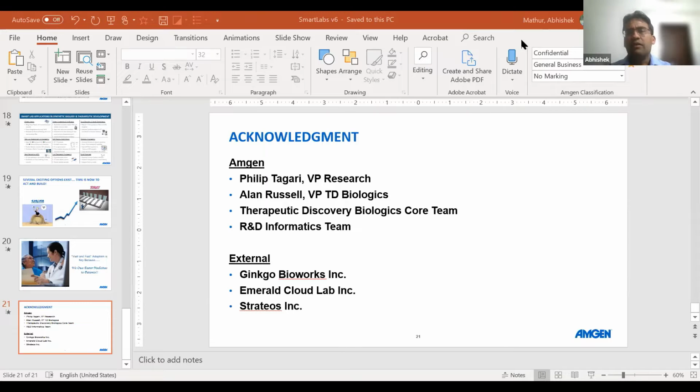I'll give an example, like protein synthesis. Let's take a membrane protein, which is a very complex protein, and you need multiple iterations and optimization. So you create a design, for example a design of experiment, and you rely on the past datasets that you have for similar domains. That can tell you what kind of conditions would work for creating a new domain for this protein. So past data is important. As humans, we remember that for making this helical structure with a very small pocket, we used these conditions and this sequence that really helped. We store that in our minds or our notebooks, but AI can retrieve that information very rapidly.